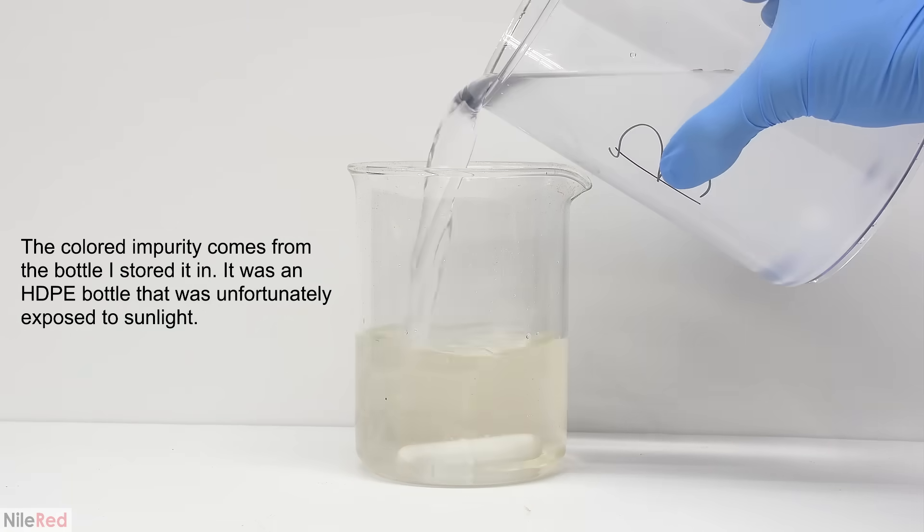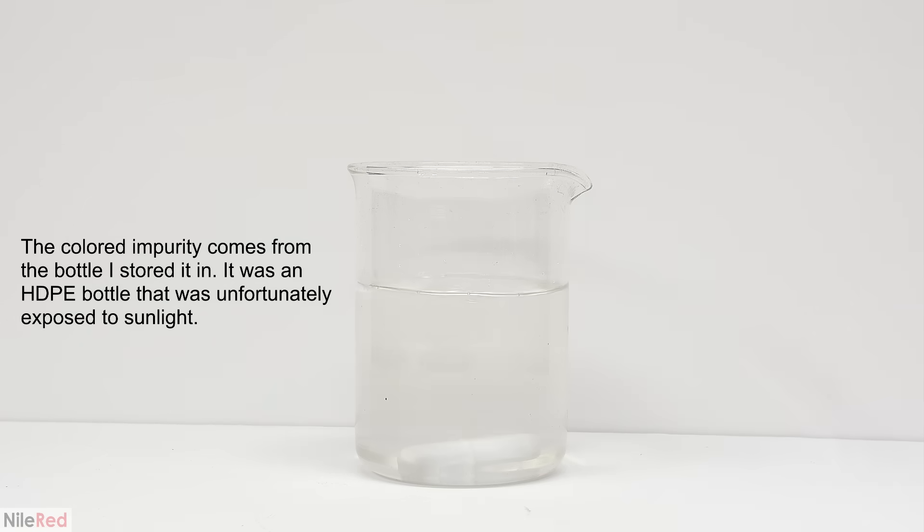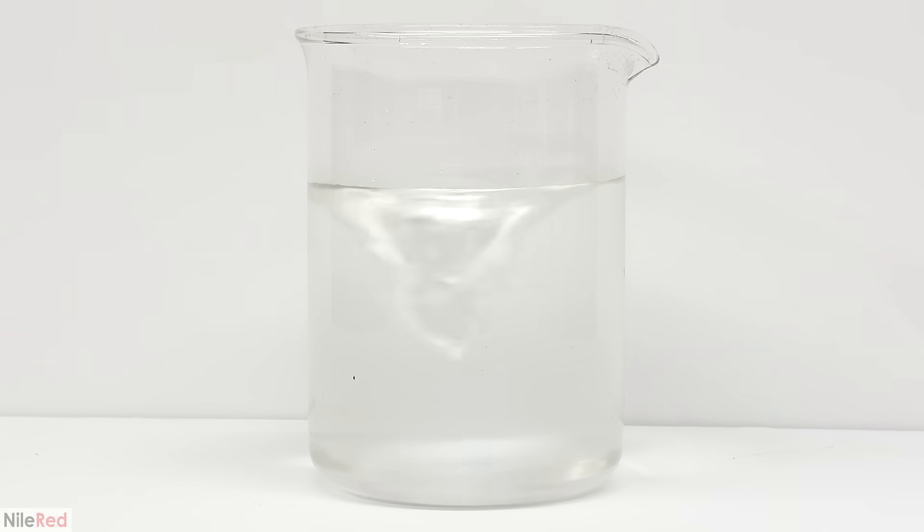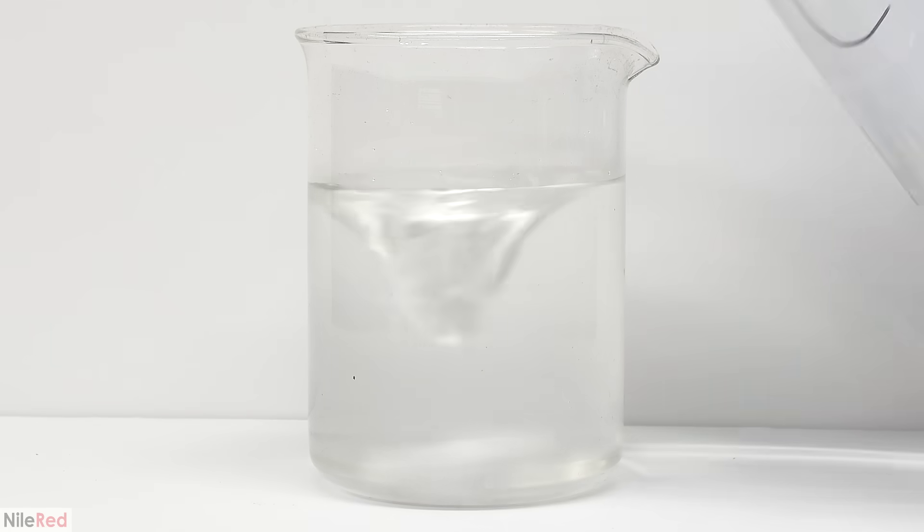The addition of solution B takes away the yellow color but I'm not exactly sure why. The impurity that's present is somehow reacting with solution B and becoming colorless. If any of you guys think you know what's going on I'd love to hear your theories in the comments. With A and B added I turn on the stirring and at this point not much should be happening. The magic happens when I add solution C which contains the peroxide.